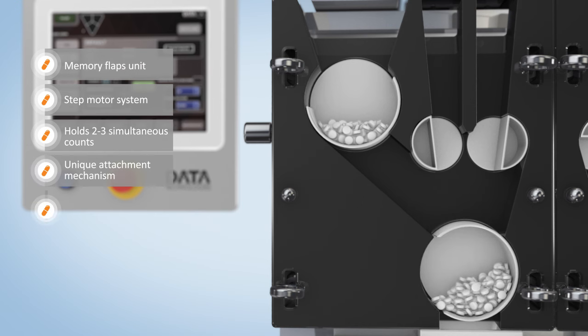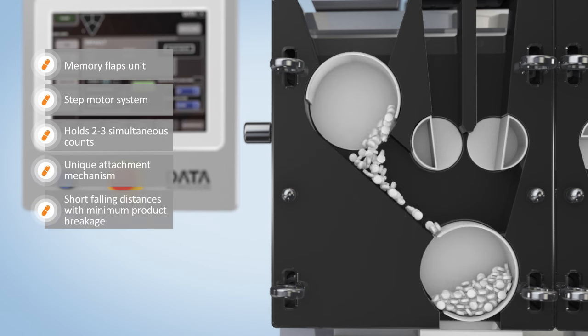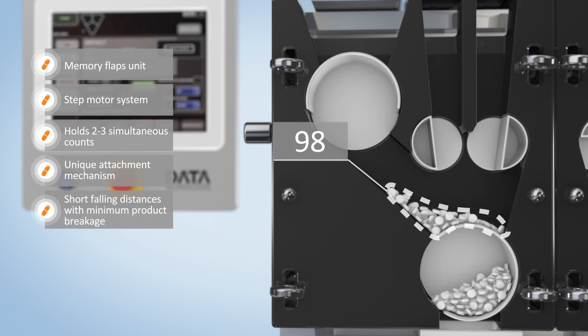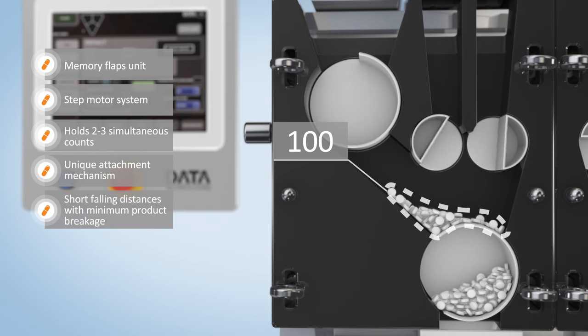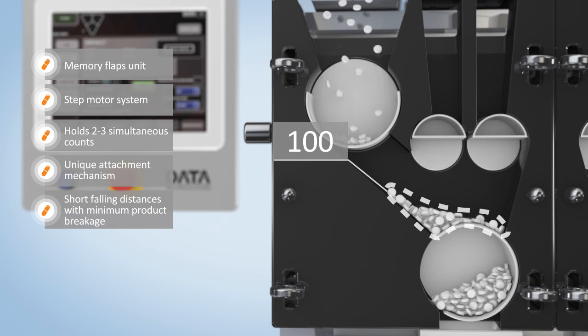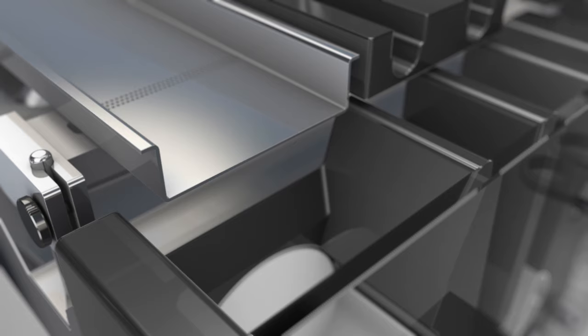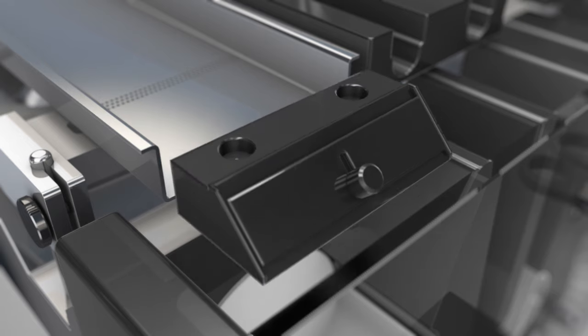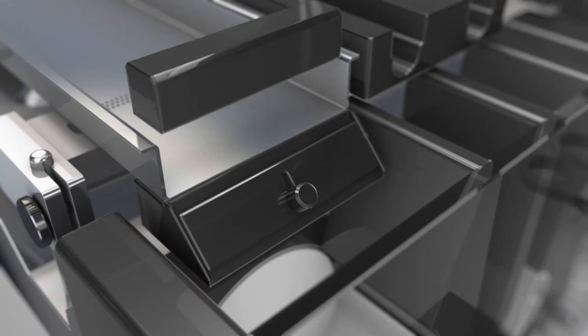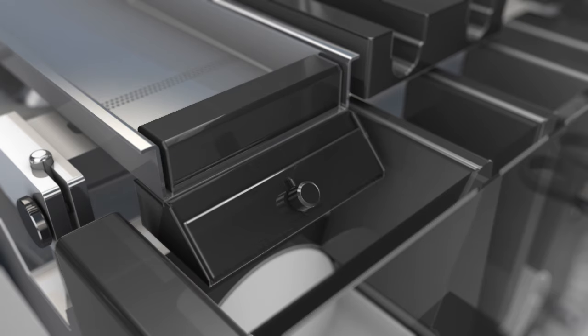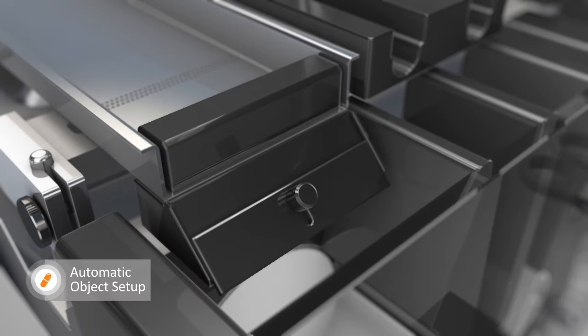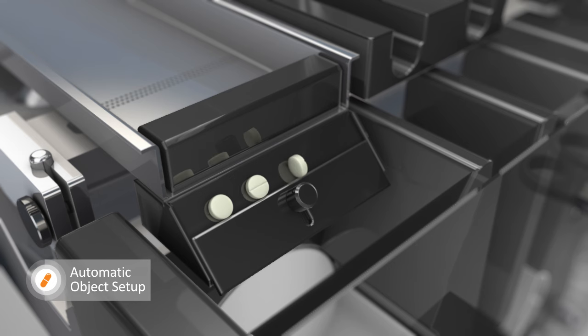The ICU design enables the operator to visually monitor the tablets, all the way from the hopper to the bottle. New object setup is done automatically. The objects are set on a special jig, and once in position, the camera scans all object parameters.